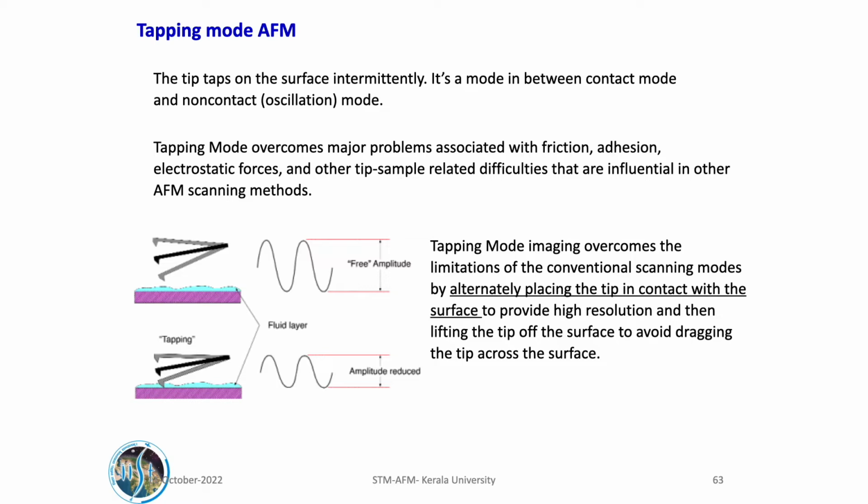It's not like away, like a spring. That van der Waals force spring will be very strong if it is coming very close to the surface. So tapping means the amplitude reduction will be very large. There will be a very strong phase reduction also.